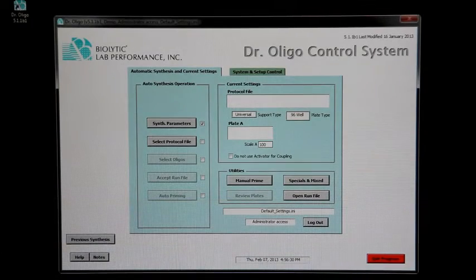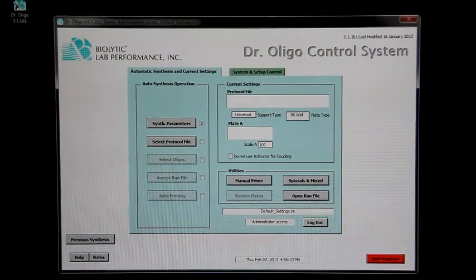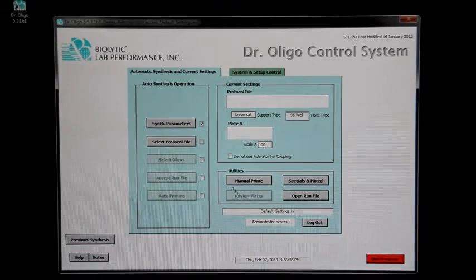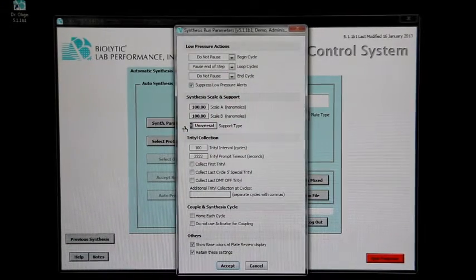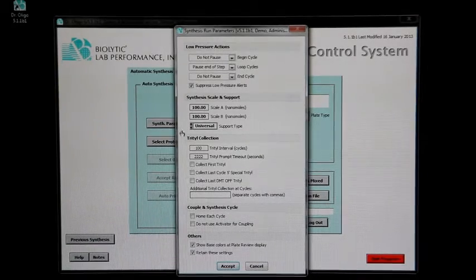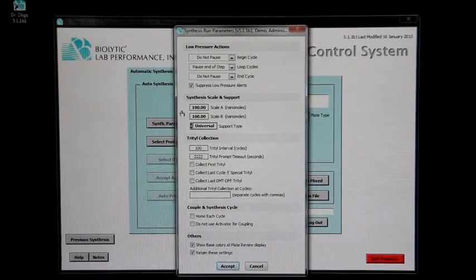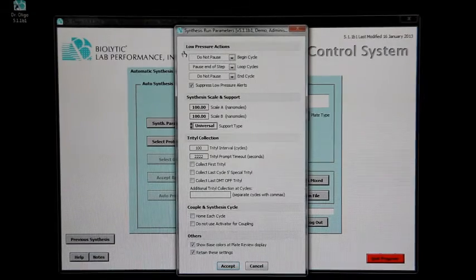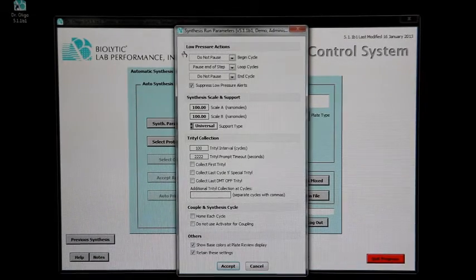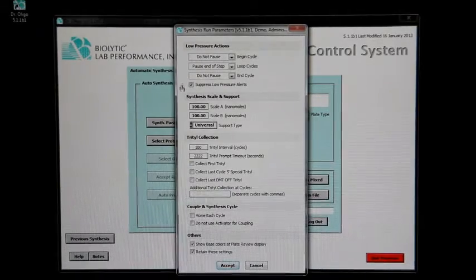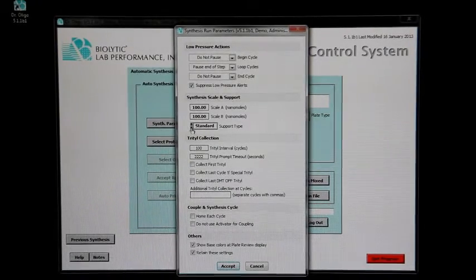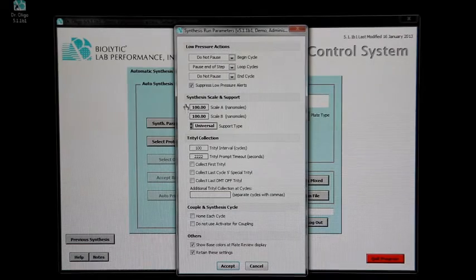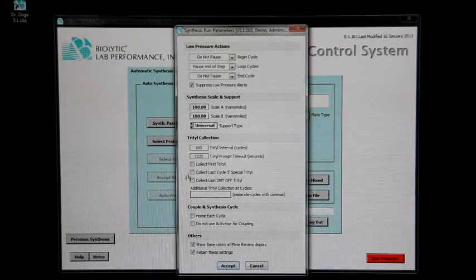Next, the software must be configured for the synthesis. Click synthesis parameters to adjust various parameters such as what the instrument will do if it detects a low pressure in one of the pneumatic gas systems, that is, if the green light turns to red. What kind of support is being used, universal or standard, what the synthesis scale is, and other options.